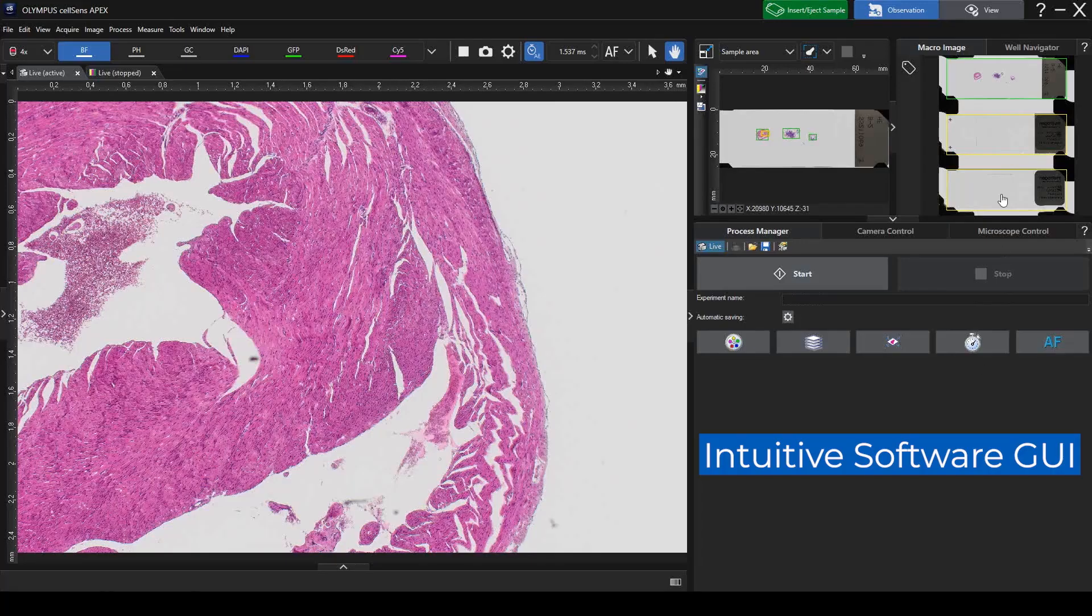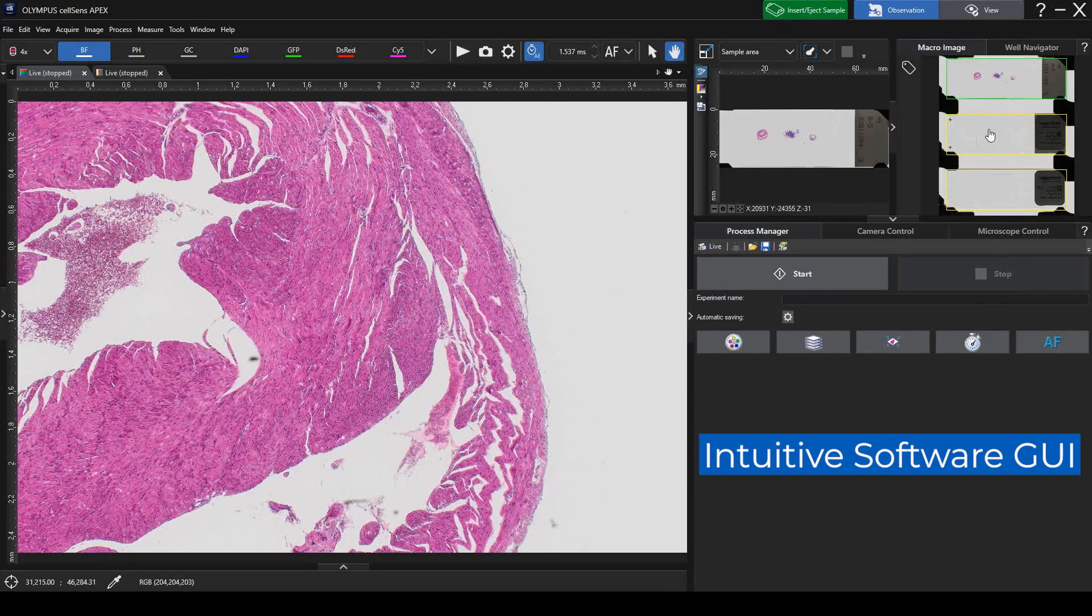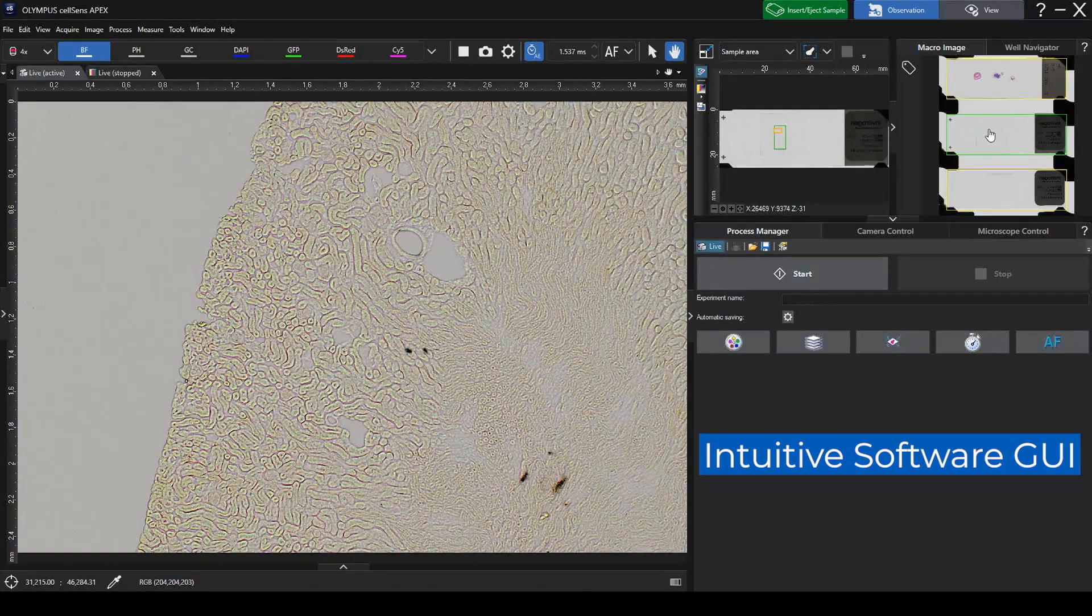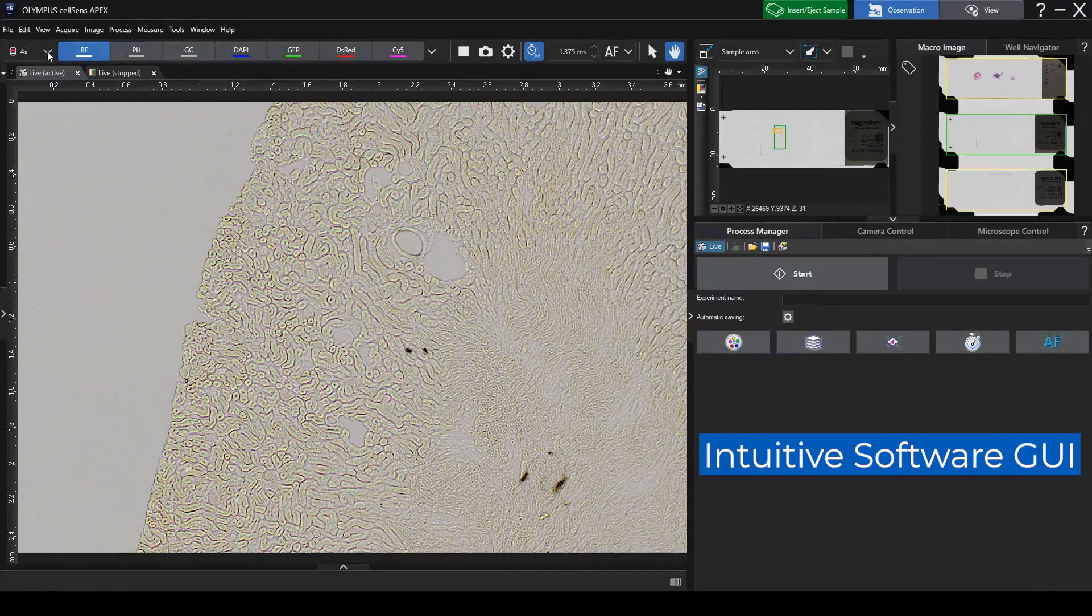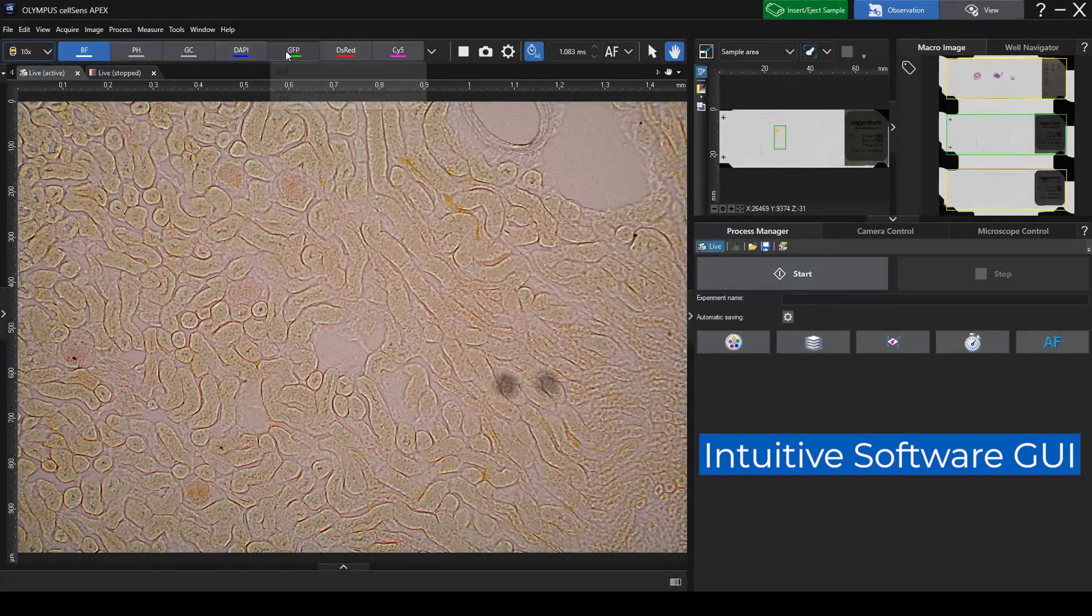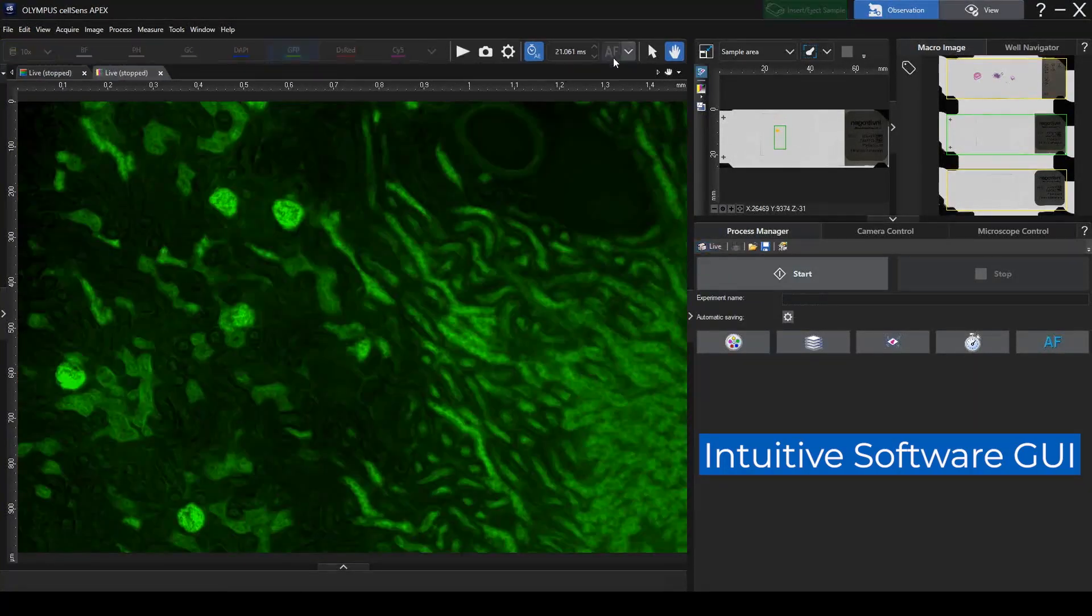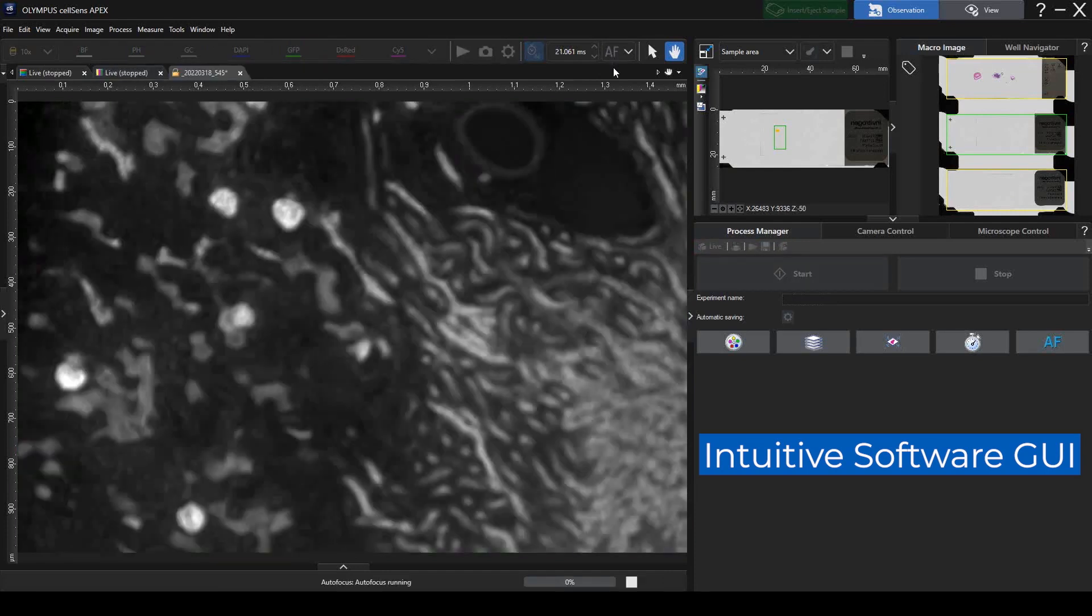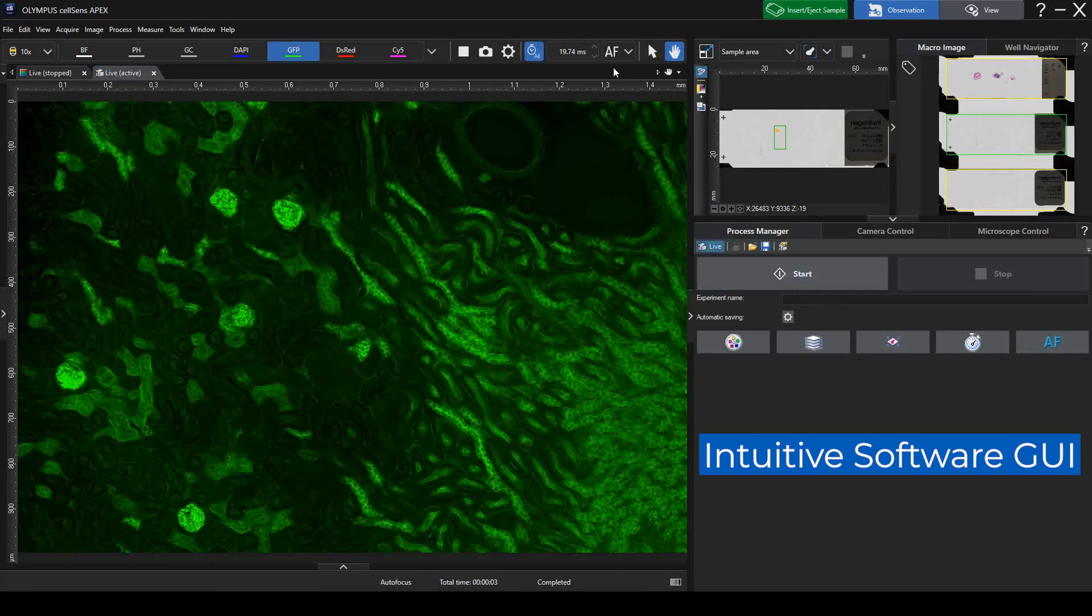The new user interface is optimized for an intuitive workflow, so that anyone can easily acquire reliable data. And because it's a fully enclosed microscope, it can be placed wherever it's convenient for you, no dark room required.